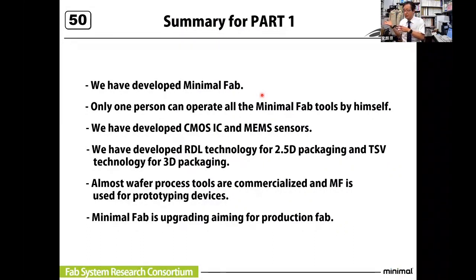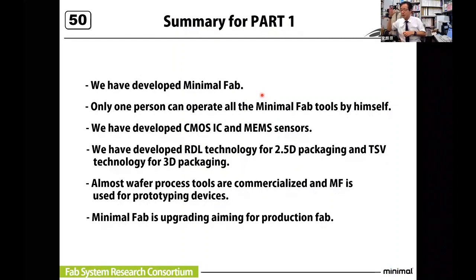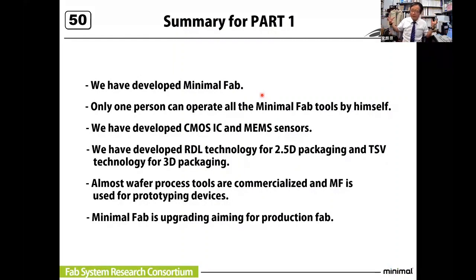In the scientific world, we are using scanning technologies for irradiation and detecting systems, as you know. But no one wants to use them for larger wafers because it takes time. So this is a big difference between the science world and the technical world. We want to combine them. To do that, a bit smaller size is better. There are many other reasons, but the main reasons are like this. Can you understand this? Yes, thank you very much. You're welcome.